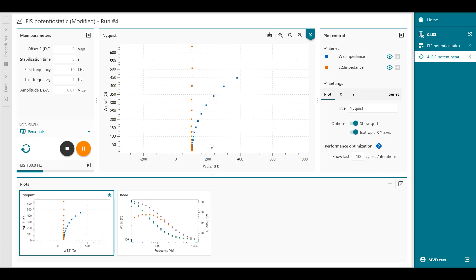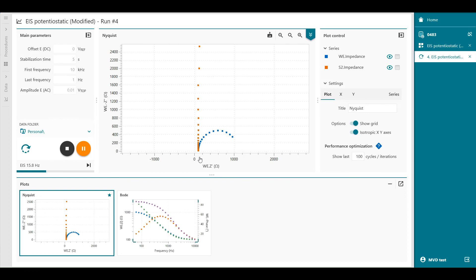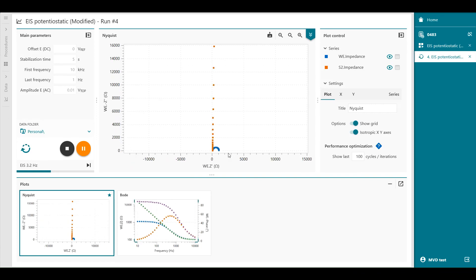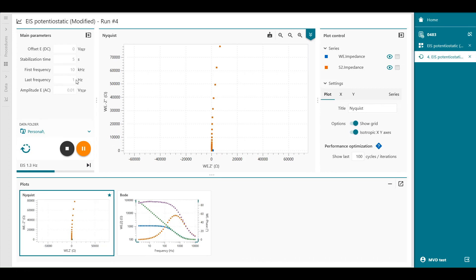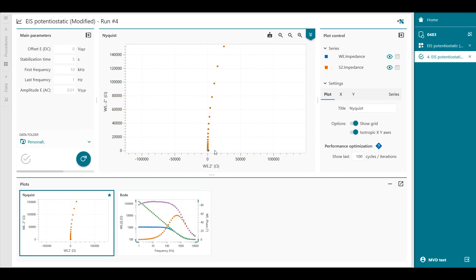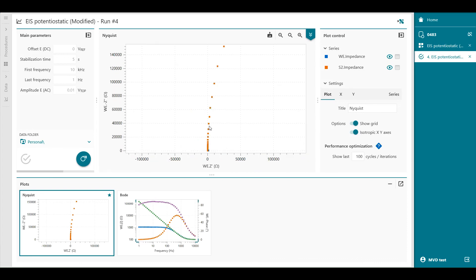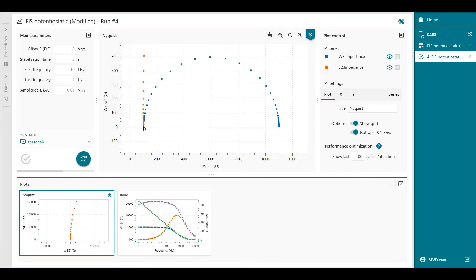You already see the difference appearing. The blue line will go to roughly 1100 Ohm, because we're starting at 100 Ohm in our test cell, and the diameter of the semicircle shows the charge transfer resistance. Of course, you can scan to a lower last frequency, but that takes longer to show the complete semicircle of the 1 MOhm. If we zoom in at the end of the measurement, we can zoom in on the lower part and find the test cell of 1000 Ohm — the diameter from 100 Ohm to 1100 Ohm is a 1000 Ohm charge transfer resistance.